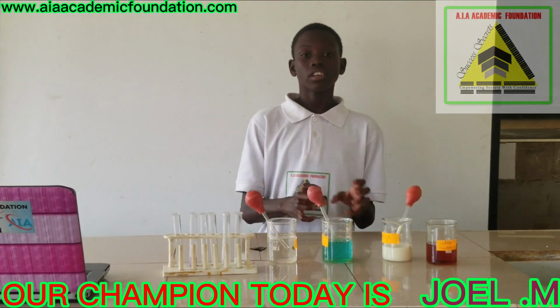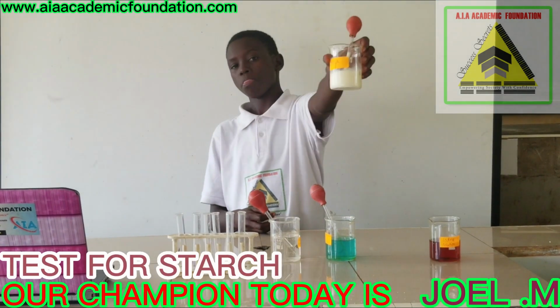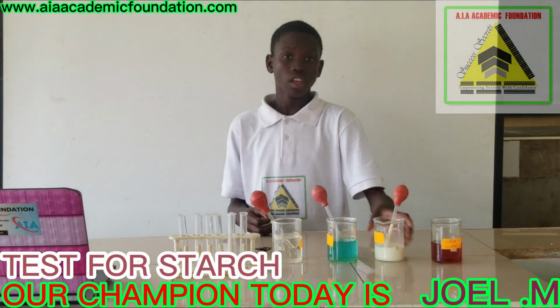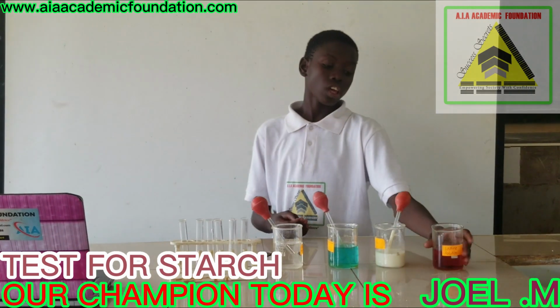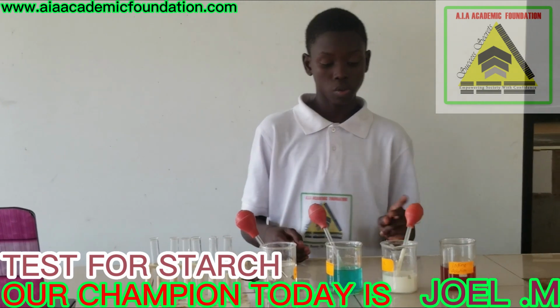So for my next experiment, I'm going to determine whether milk contains starch. And for this, we are going to need iodine as our reagent to test for starch in milk.